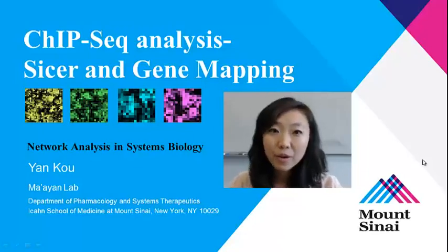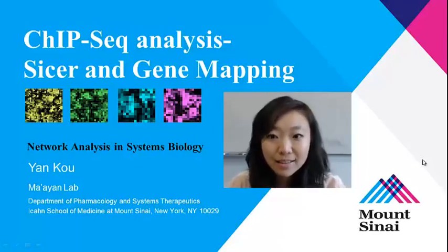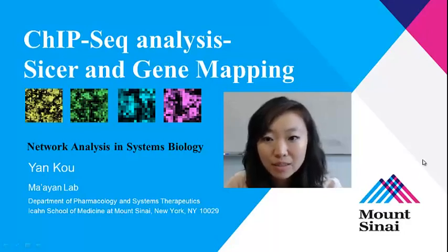Hi everyone, welcome back to the ChIP-seq data analysis. In the last lecture, I introduced the ChIP-seq technology and how to use MACS to detect the DNA binding sites for the DNA binding proteins. In this lecture, I will introduce how to use another peak calling software called SICER and also how to map the peaks to the genome.